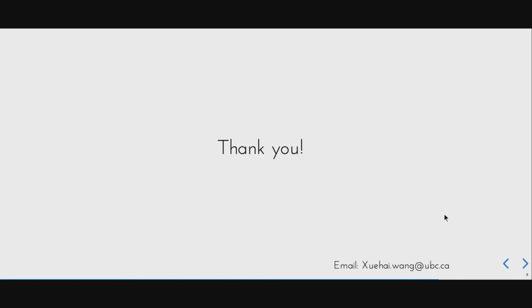Our vision is to build a lab with automation all the way through, from the wet lab part, pipetting, cocktail making, adding antibody, lysing red blood cells, to the data analysis. We strongly believe this is going to be the only way going forward.